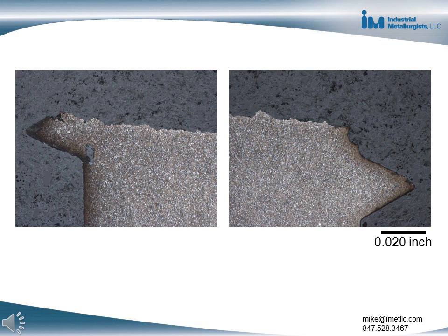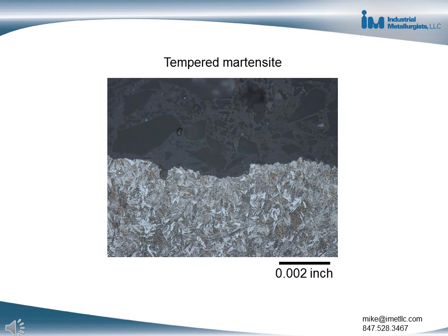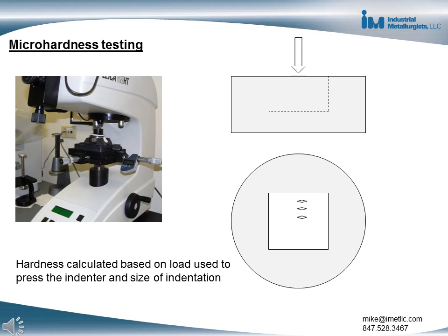These images of the etched sample show the metal along the fracture surface and below. This higher magnification image near the fracture surface shows tempered martensite, which was present throughout the entire sample. Martensite is a metallurgical phase in steel, and its presence indicated that the screw had been through-hardened by heat treating. Micro hardness testing involves pressing an indenter into the metal surface and measuring the indentation size. The consistent hardness measurements through the screw thickness confirmed that the screw had been through-hardened.